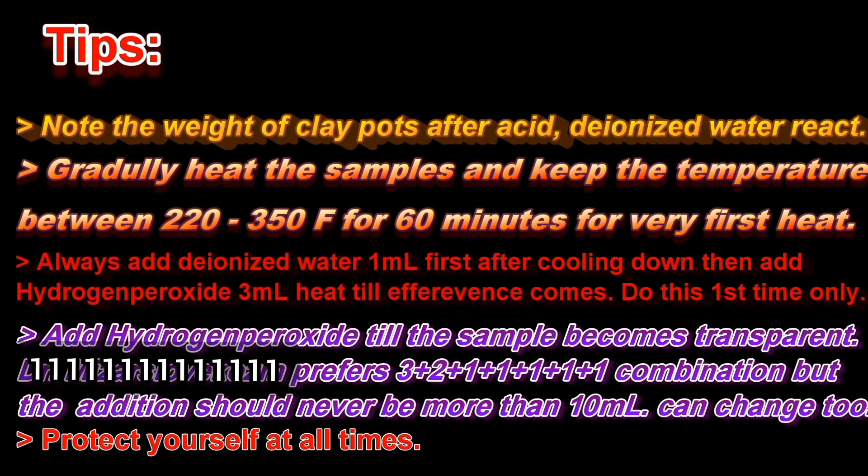Here are some tips which were extremely beneficial for me during this process — you can pause this video and follow them. Now as the digestion process is completed, it's time to move on with the volumetric flasks — use the sample and measure it first in the graduated cylinder and note it down according to its label in your notebook. Then use deionized water to dilute it further. As you can see here, deionized water is slowly being added to dilute the sample and reach the required amount, which in this case is about 100 ml. Then you take the sample and add it into its respective volumetric flask. Before doing that, you have to first add a filter paper to filter the sample so that impurities are not added into the final sample.